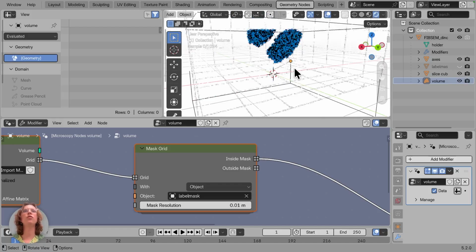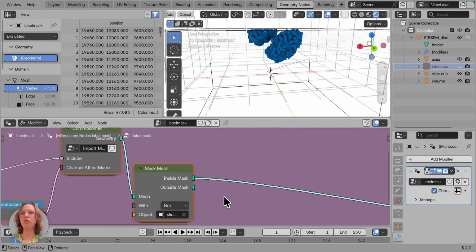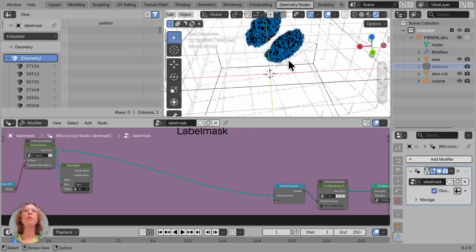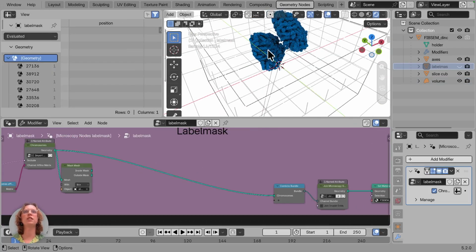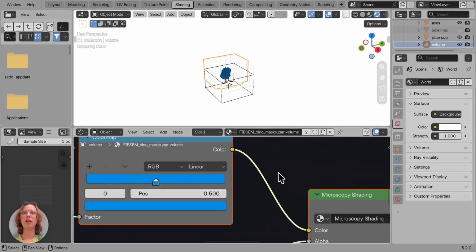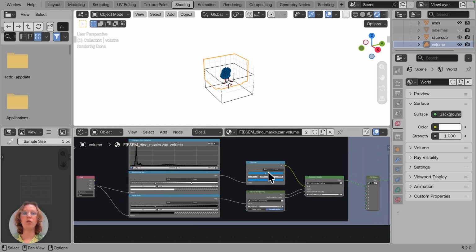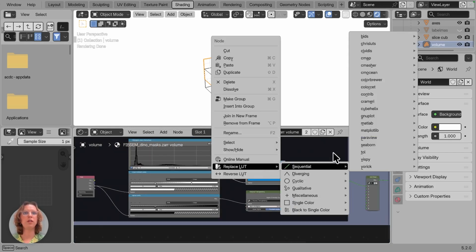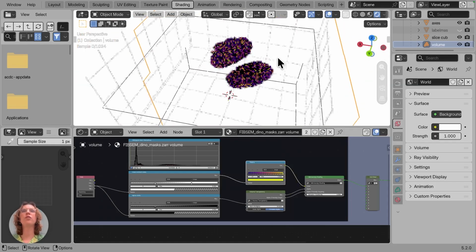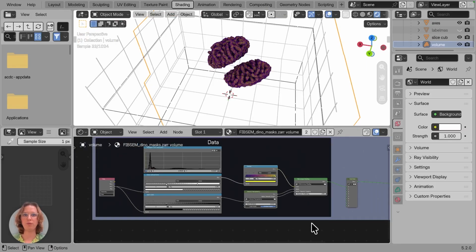And we see that this is also still sliced by the slice cube, even though this is not connected. And that is because the label mask itself is masked. So if we circumvent that, then we just see completely all of our chromosomes as separate objects. And what's also nice about this is that we still have all of our original pixel values. So we can actually still show all of our individual pixel values, not that these are extremely interesting here.